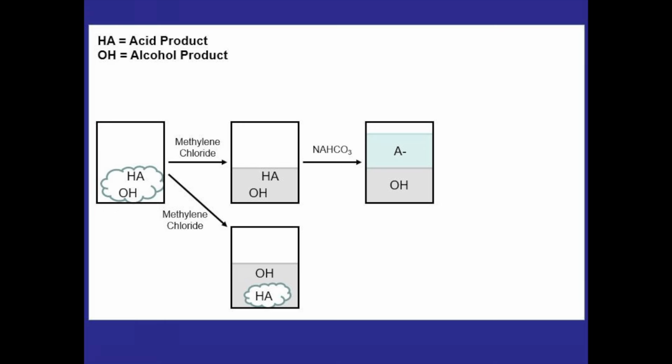Be mindful that methylene chloride evaporates pretty easily and can start evaporating just by absorbing the heat from your hand. So just because we hear some gas coming out of the test tube when we open the cap doesn't mean that it's coming from the sodium bicarbonate reaction. Usually the CO2 bubbles come off after the first 2 or 3 shakes, and we'll hear a more prominent fizz upon opening the cap after those first 2 or 3.